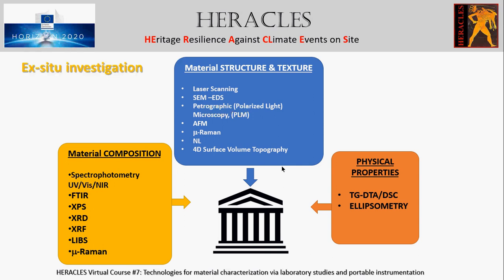In the case of weathered samples from built heritage, it allows high spatial resolution 3D imaging in very small specimen areas, which is useful for the detection of biodegradation phenomena, like the presence of algae, cyanobacteria, lichens, and fungi. The sample recuperation is full.